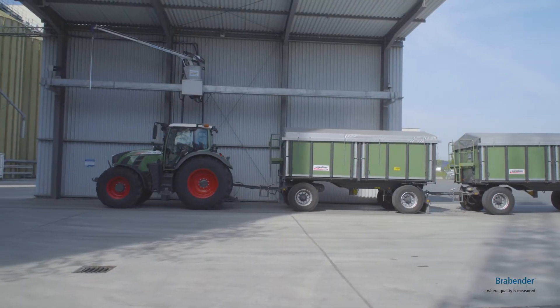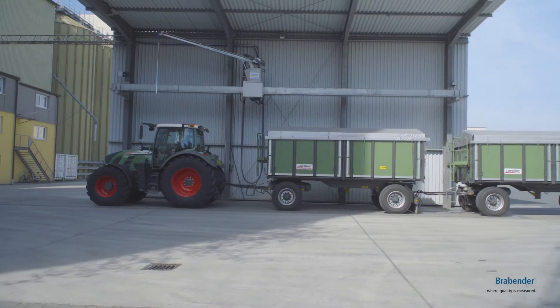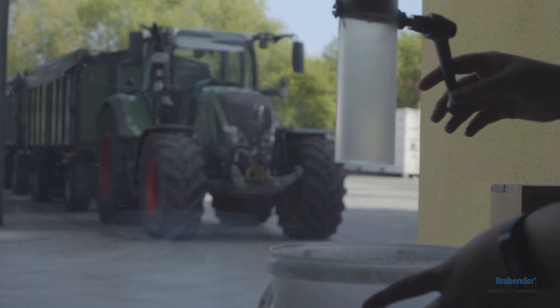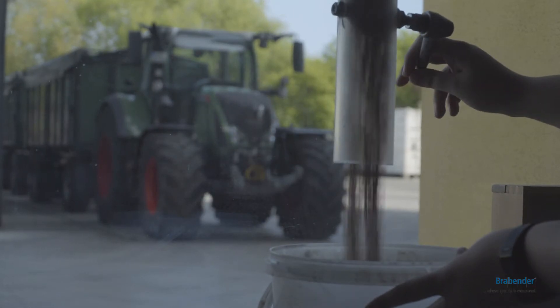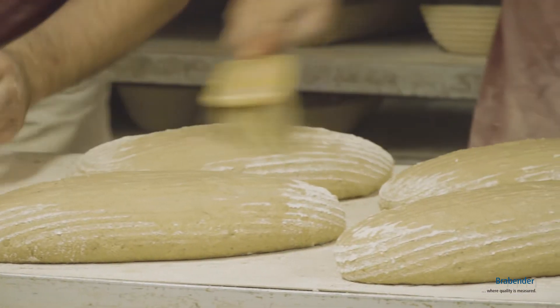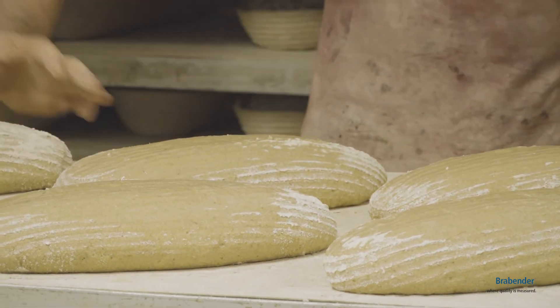The determination of the raw materials quality is a standard task in the milling industry. A definitive criterion for the evaluation of baking properties is the content of gluten in flour.